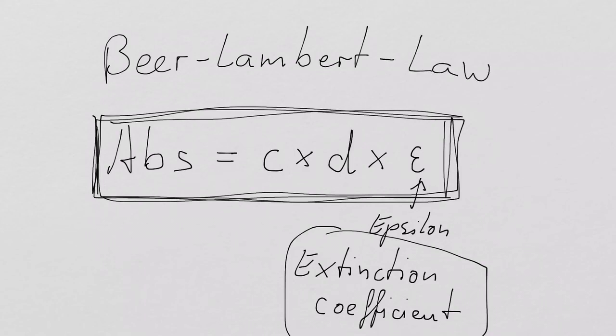And this is something that you need to know. Absolutely, that's not negotiable. Every biologist needs to know Beer-Lambert. Yeah? Now, question for you. Does the Beer-Lambert law, as it is written, have explicitly the wavelength in it? No. Right?